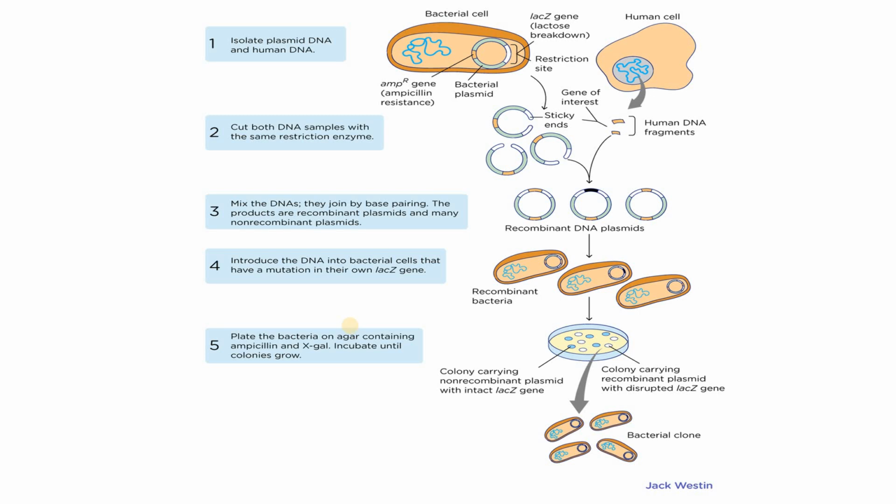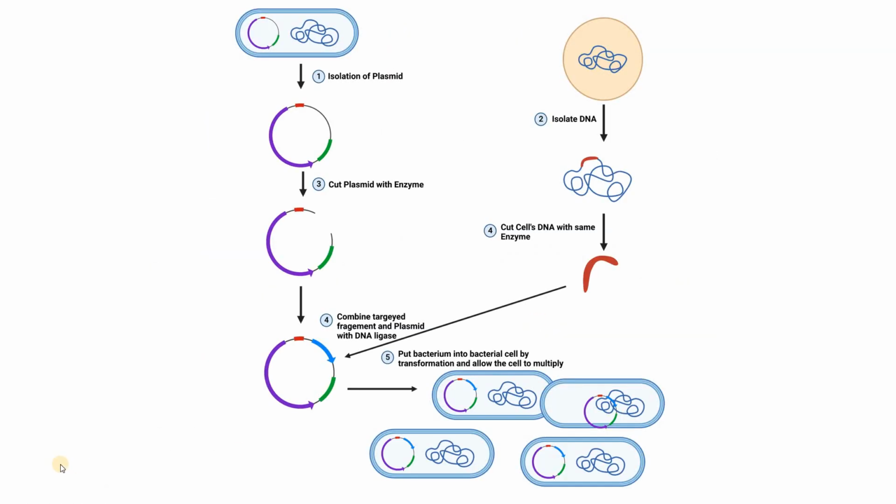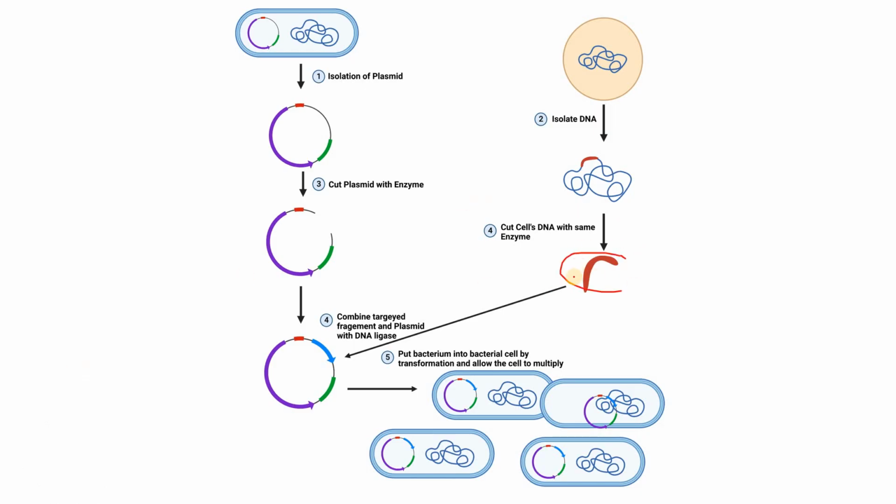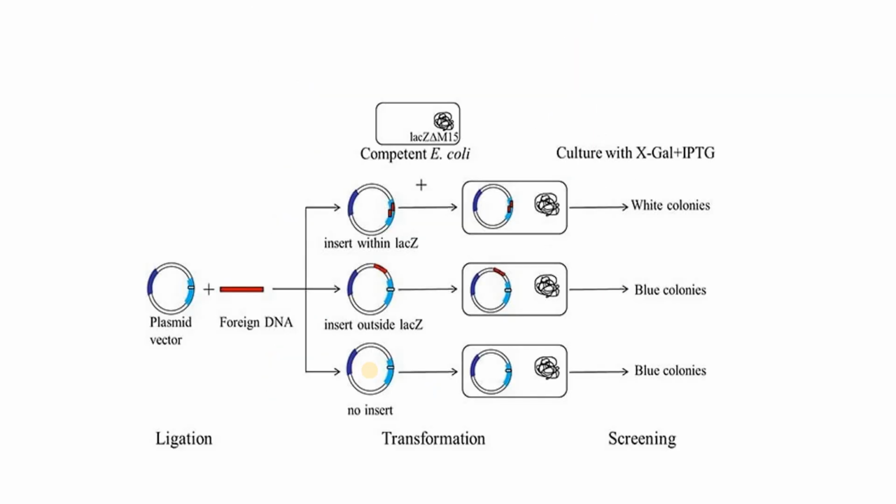In this video tutorial, we will understand the concept of blue-white screening. In the last video, we saw that when we are inserting our gene of interest into the plasmid, there are three different possibilities.